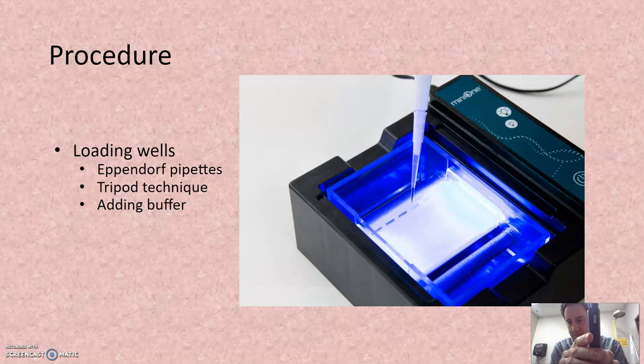And so these pipettes are set, I think you can see a 10 right here. I don't know, can you see that? And so I think that's 10 microliters, I think. I'm not sure the unit, but you're going to draw out that precise amount, and then you're going to put it into the well, which is kind of challenging. So they sort of recommend you put your two elbows on the table and then kind of go like that to aim inside the well.